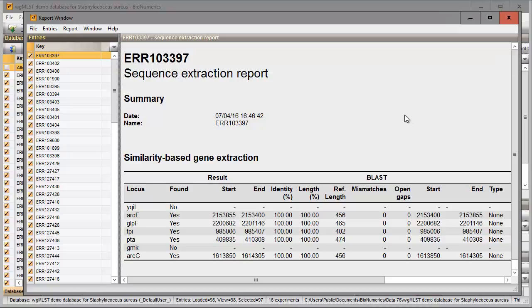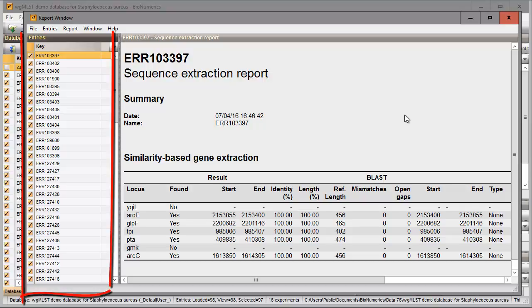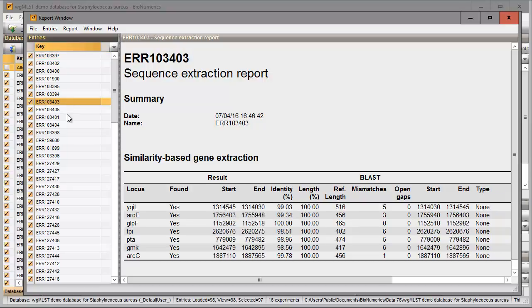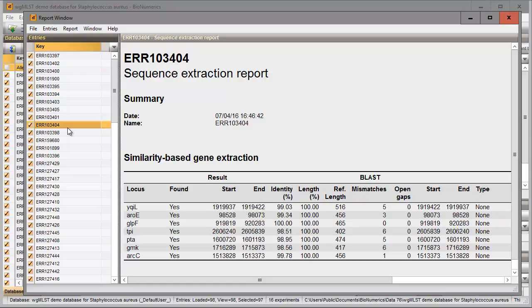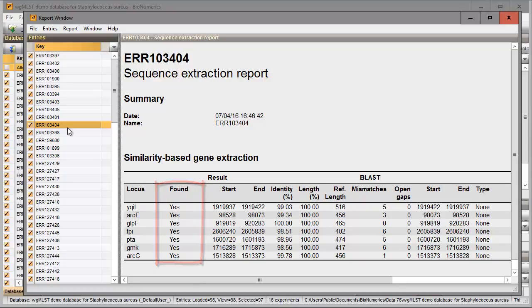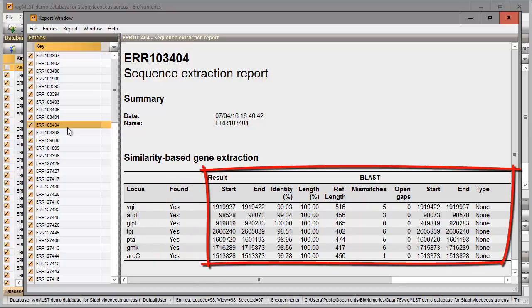This window displays a summary of the extraction results. The entries included in the search are displayed in the entries panel. The results of the highlighted entry are displayed in the panel on the right. The destination experiments are displayed in the first column. The second column displays whether or not a BLAST hit was found. More information about the BLAST results can be found in the other columns.